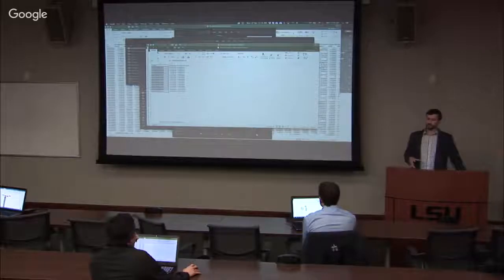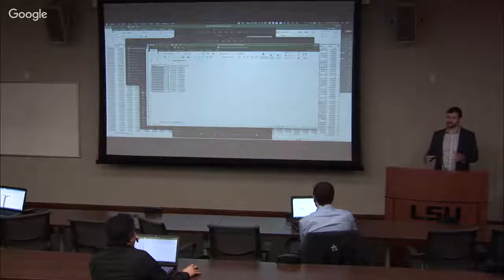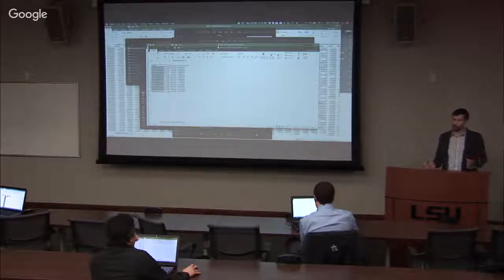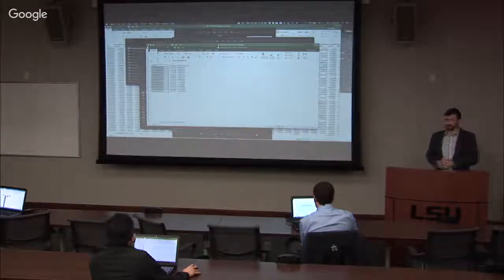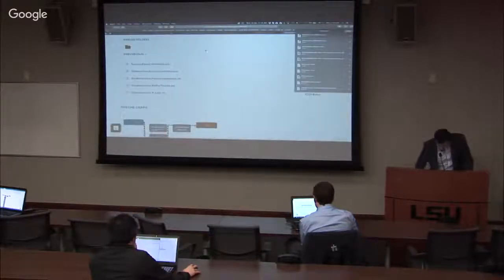So that is how you can use a combination of unsupervised and supervised methods to first understand your data, then do some analysis that will give you a number of genes that you're looking for, and then transform that into a data set that you can take into downstream interpretation. Now let's take a look at the result of our latest pipeline.